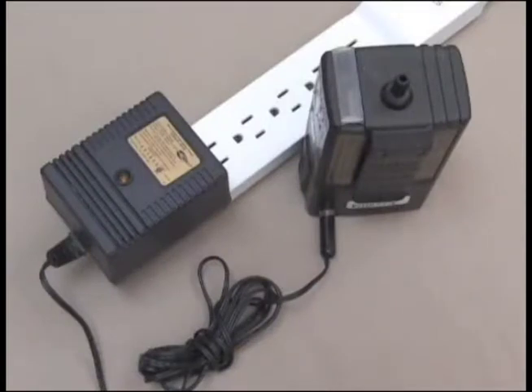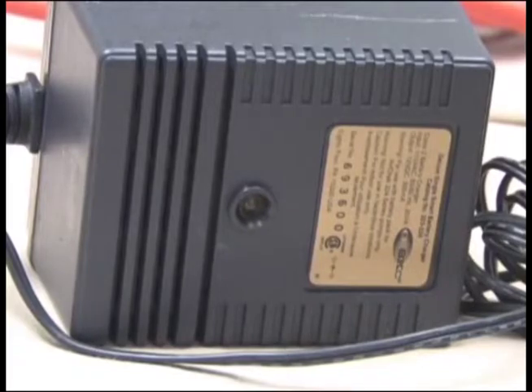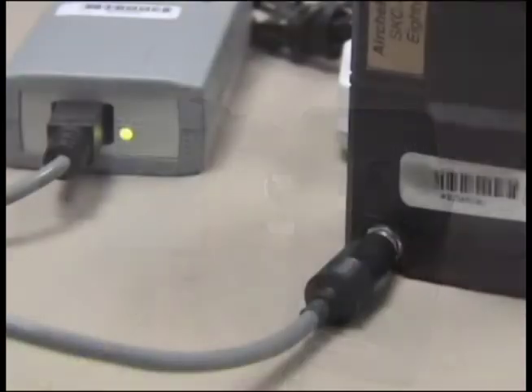When using the simplest single style charger, the light will illuminate on the charger when plugged in. Adjust the connection as needed until the light illuminates. This light will flash when the battery is fully charged. When using the single power flex charger, the light near the port will illuminate red when plugged in. Adjust the connection as needed until the light illuminates. These lights will change to green when the battery is fully charged and will remain in trickle charge mode until unplugged.